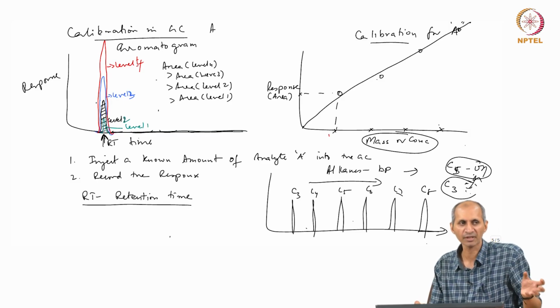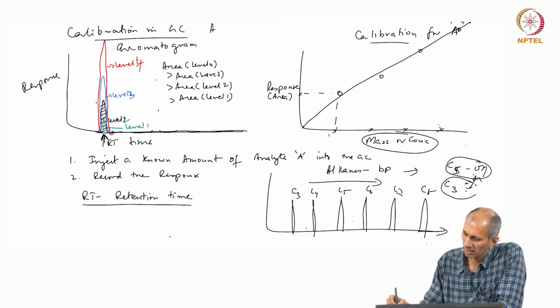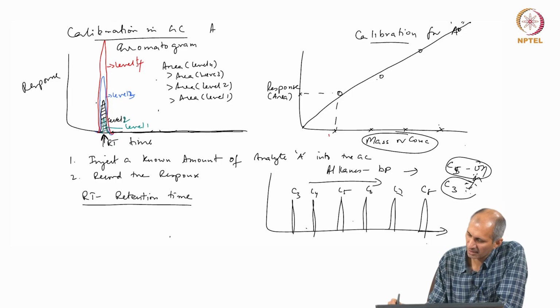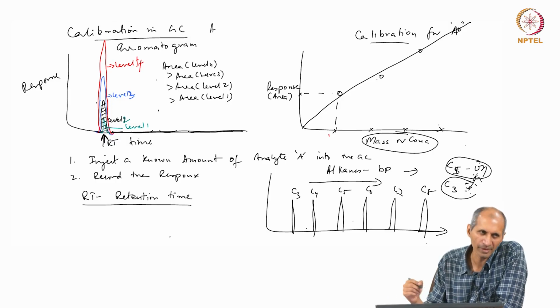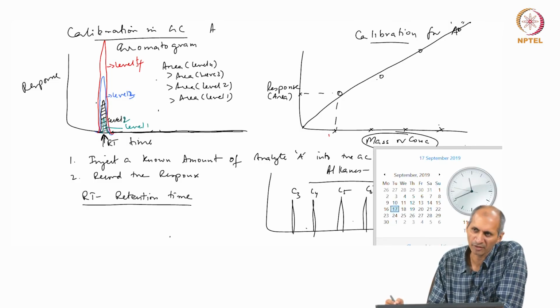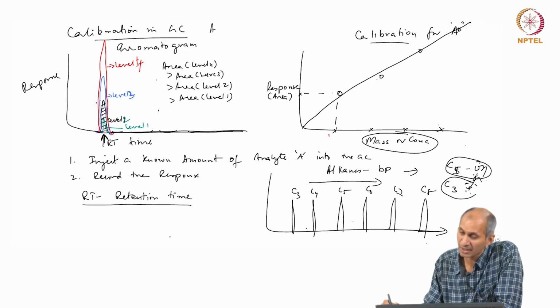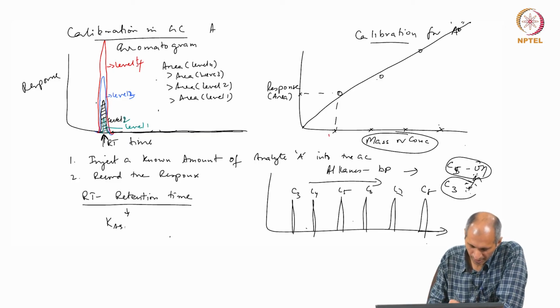If the stationary phase is very non-polar, it does not like it, and the partition constant is very different for this one. So, in this case this analyte and this analyte are not similar, and they do not follow a trend simply based on molecular weight or boiling point. It is based on the functionality, that is, the functional groups attached to it. So, essentially the retention time we know is a function of the partition constant, and there are three things here: A, S and M.